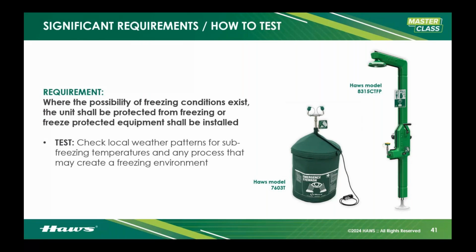Okay, I have a nice collection of photos of popsicles that were formerly emergency equipment in cold regions. So watch out. Make sure you're testing at the worst time of year, the most likely time you're going to see freezing temperatures, and ensure that you have the right equipment in place.